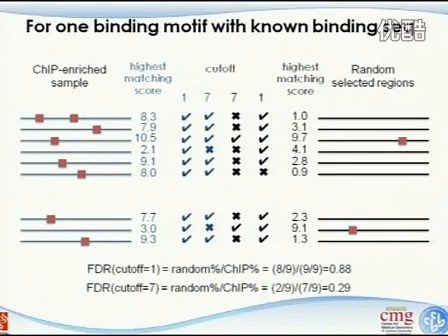And then when I further look at that, I found that a lot of those binding sites are CG enriched, okay? And we know that in the promoter regions, there's a lot of CpG islands, meaning those promoter regions are CG enriched. So if I'm comparing the ChIP identified region versus random genomic region, I'm ending up selecting the differences which potentially are the difference between the promoter region and the random region. It's not really anything to do with the ChIP experiment I did, right?